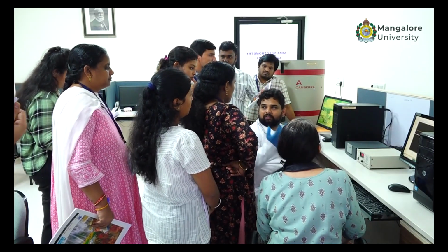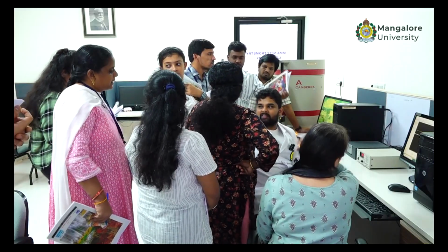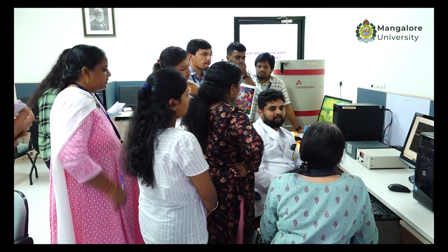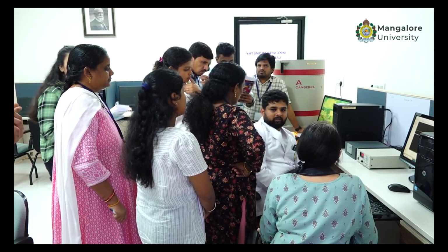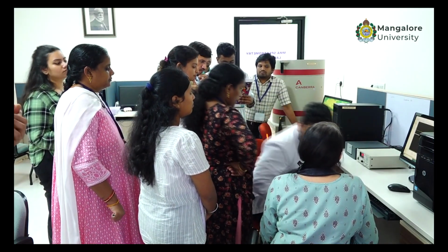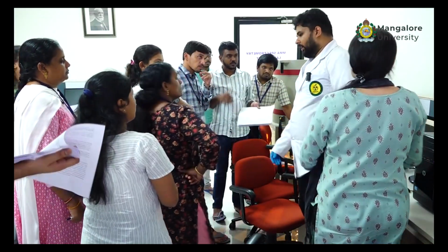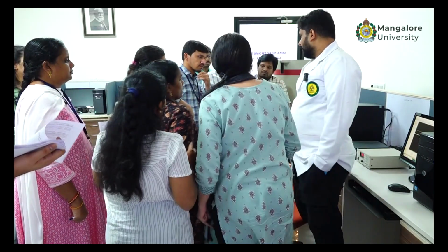How much standard deviation do you give? Like 100 plus or minus 10%. Yeah, 10%, 15%. Here the standard deviation is pretty low, less than 5%. Okay. So the MDA formula you already know. I had already explained. Using the background that you have already taken, you can calculate MDA.